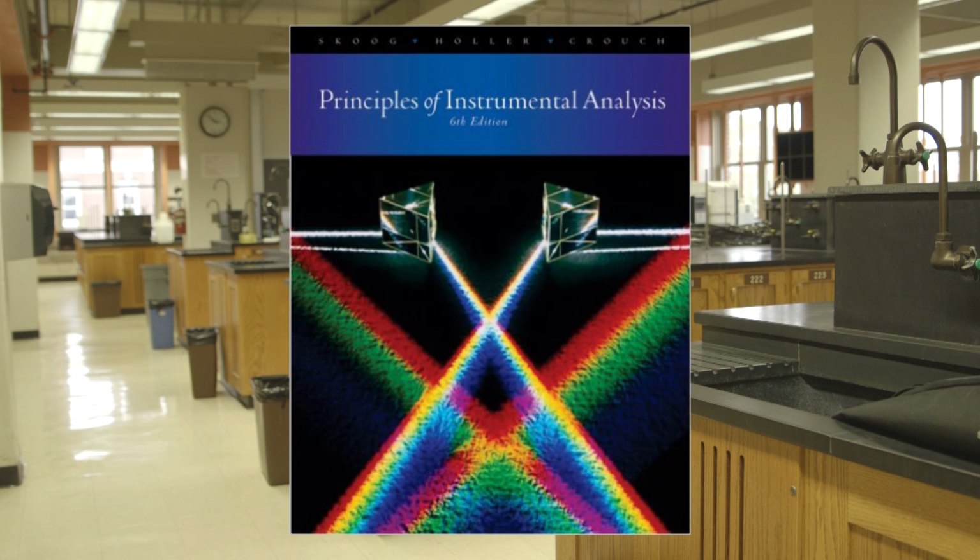For more information on this technique, see the textbook Skoog, Holler and Crouch, Principles of Instrumental Analysis, 6th edition.